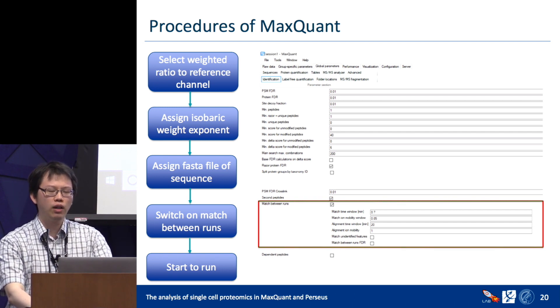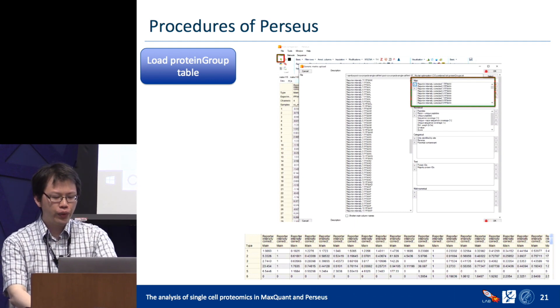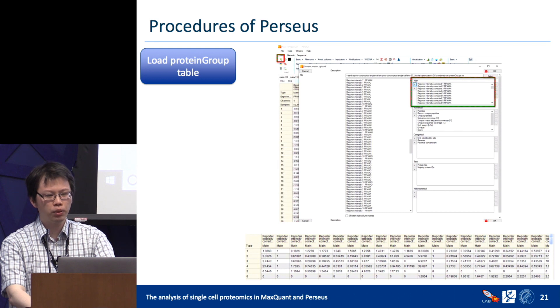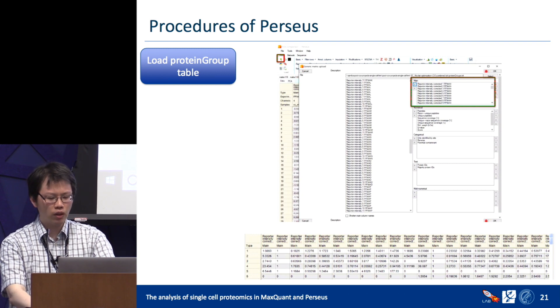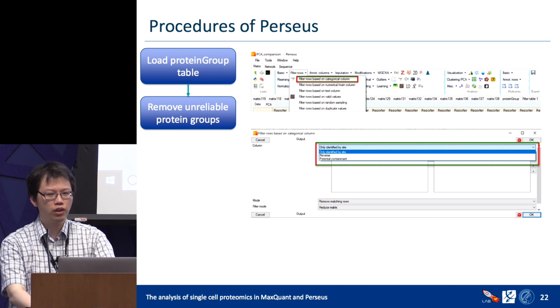After running MaxQuant, we get the output tables and can move to Perseus. Click the Load icon on the left, navigate to your protein groups tables, and all columns will appear in the left block. Select which columns you want to put into the matrix and move them to the right block, then press OK. The matrix will appear on your screen. You can also remove unreliable protein groups such as those only identified by site, reverse, or contaminant — select and remove them one by one.